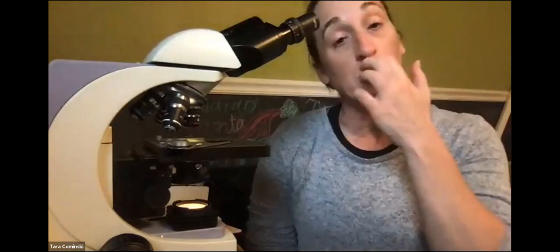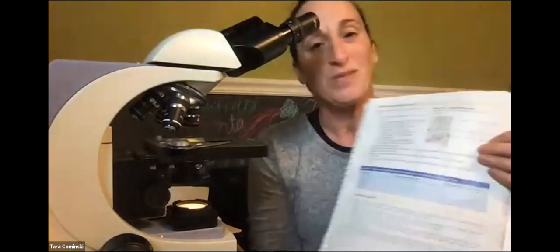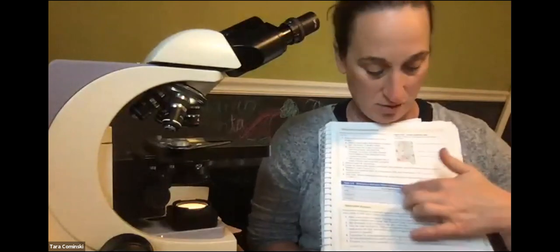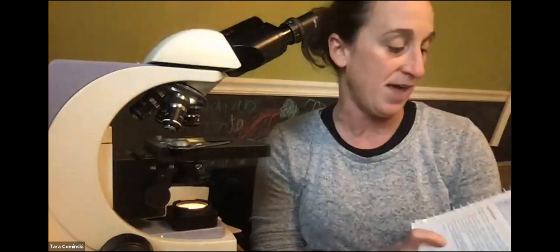Okay, so now I'm gonna share my screen. I'm gonna show you what those onion cells look like under the microscope based on the wet mount that I made, and then I'll show you my cheek cells, and then we're finished, okay? So to the best of your ability, fill out this table. And just in terms of what they look like, you can use the pictures really more than what you see from my phone, but I want to show you what it looks like live.